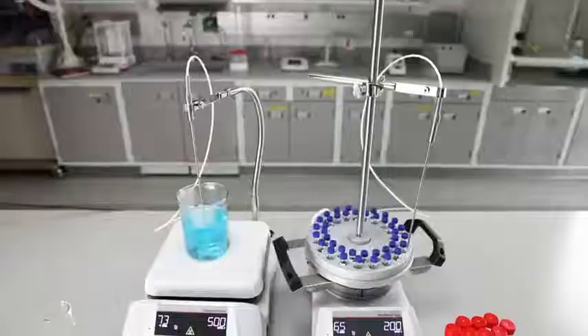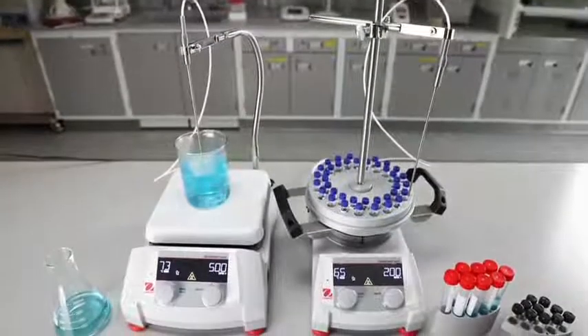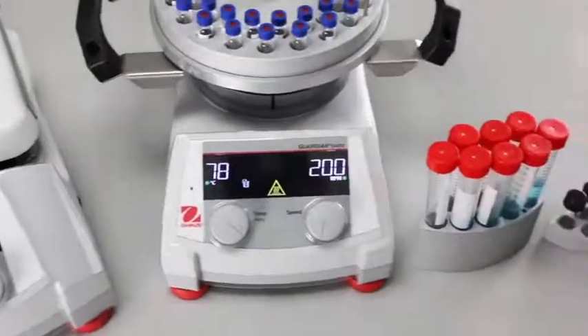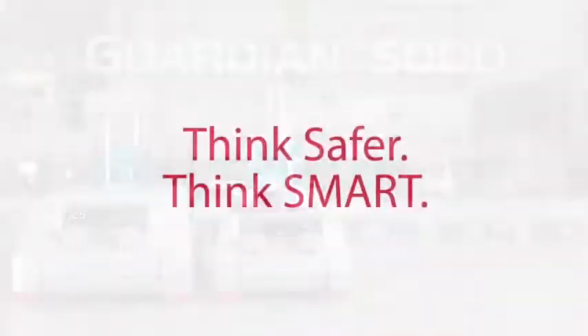The Guardian 5000 is available in 7 by 7 inch and 10 by 10 inch ceramic square tops, or 5.3 inch aluminum round top models, along with a wide range of accessories. The Guardian 5000 series hot plate stirrers allow you to modernize your lab — think safer, think smart.